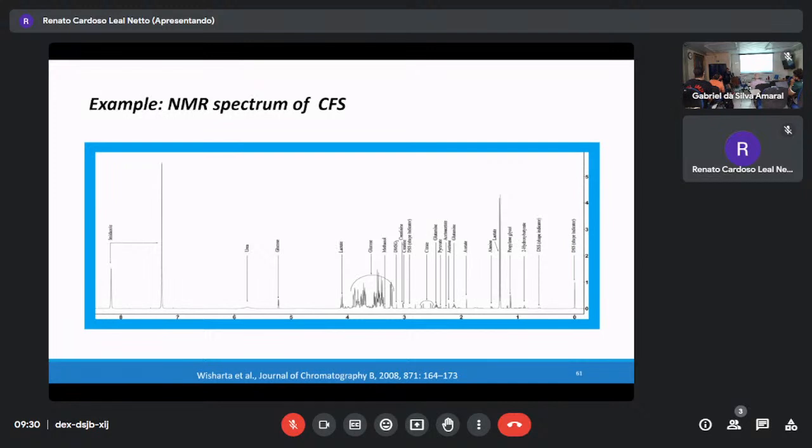Very common. Same as hair analysis, very minor. In that case, usually you may do the targeted analysis. I want to detect, and in that case, instead of the Q-TOF, you use TQ, triple quad, which would be nice for quantitation.